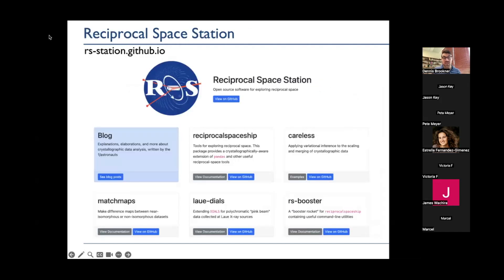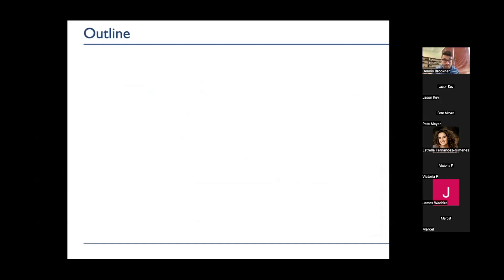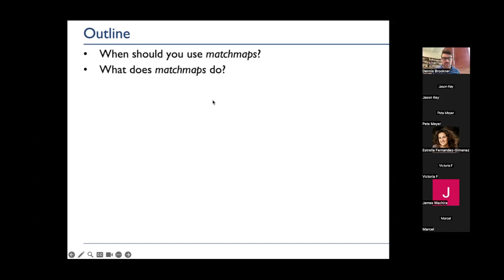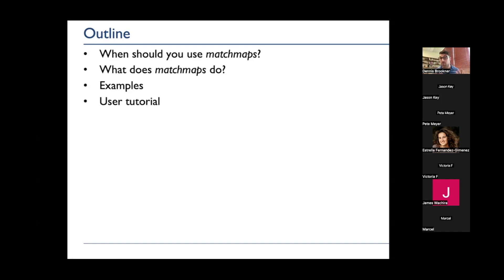This documentation lives with the Reciprocal Space Station, which is what the Hexter Lab and associated collaborators are calling this suite of software packages for handling non-standard diffraction experiments. Today I'm going to explain when you might want to use MatchMaps, talk about what MatchMaps does, give you some examples of the package in action, and then spend some time working through a user tutorial to show you how you might use MatchMaps yourself.